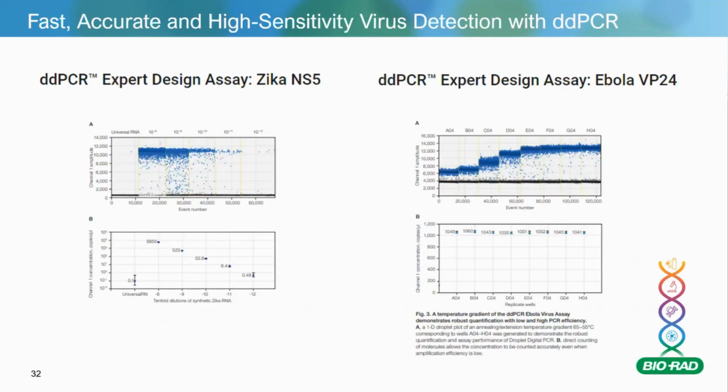And in this example, we're looking at virus quantification and detection in terms of Zika and Ebola. They basically just looked at these two infections. Obviously, these viral infections can ebb and flow during the seasons, and they can have a really intense and rapid outbreak, such as the case of Zika and Ebola. And during these outbreaks, it's obviously very important to manage the spread and the treatment of these viruses.